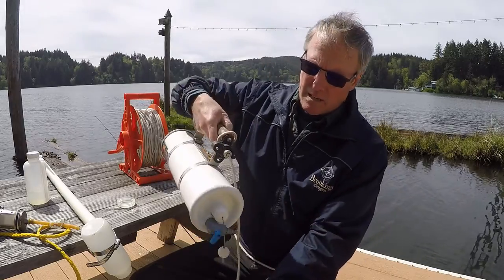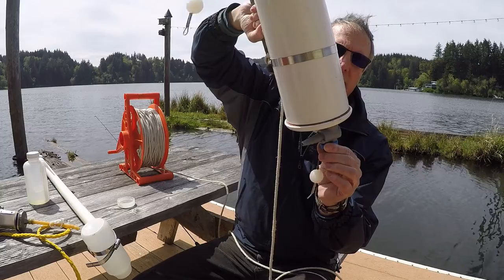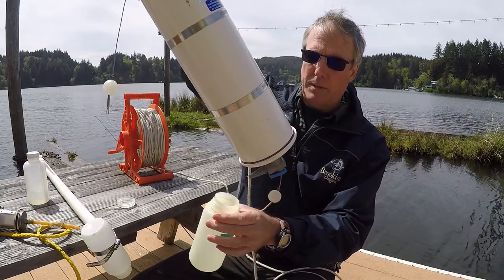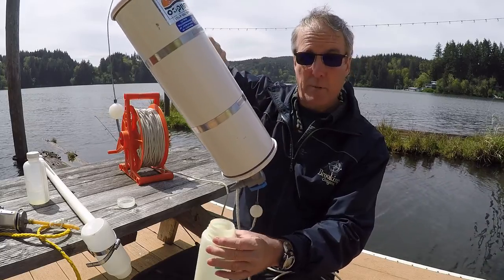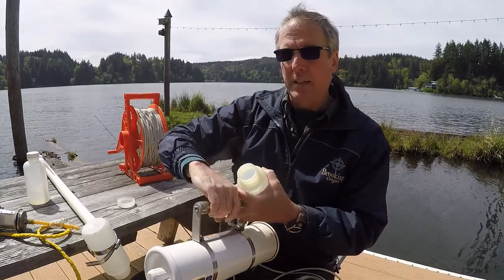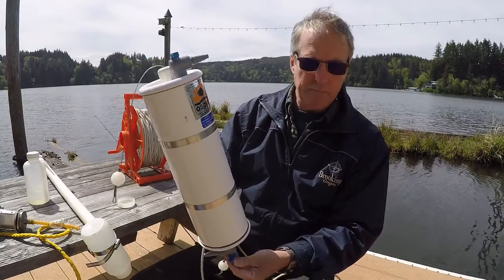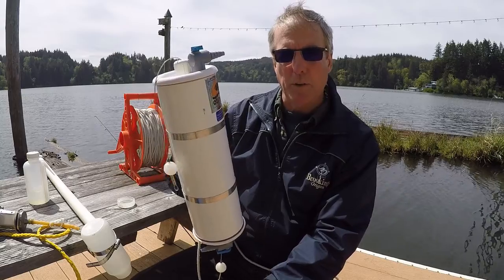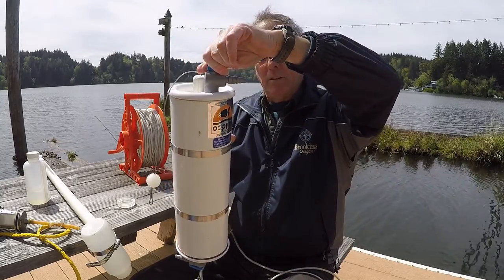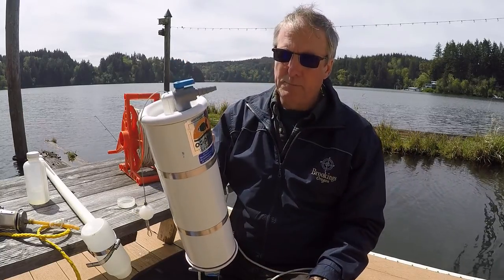I'm going to tilt this up, and then as you open this, the water would come out, and you just fill your bottle up. You usually want to rinse your bottle, so you fill it up a little bit, close it, put the lid on, shake your bottle around, dump it out, and then take your final sample. A lot of times you'll need to open the top one to make sure there's airflow to allow the water to come out.